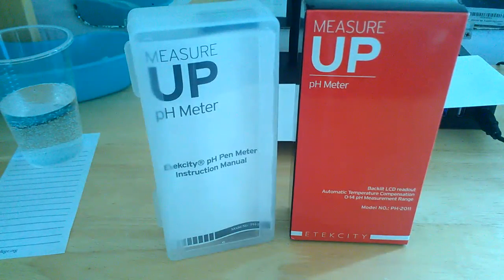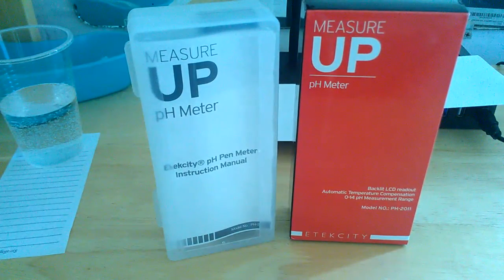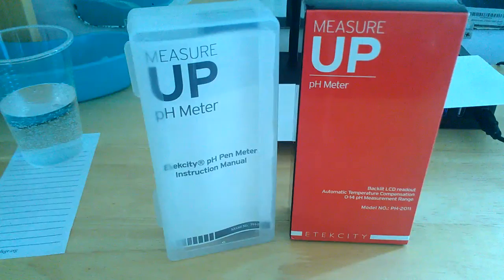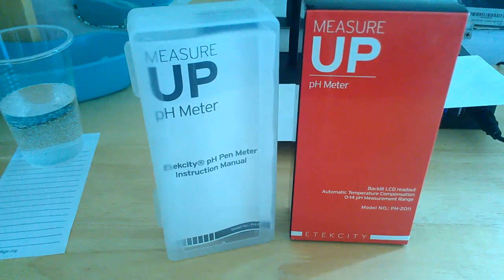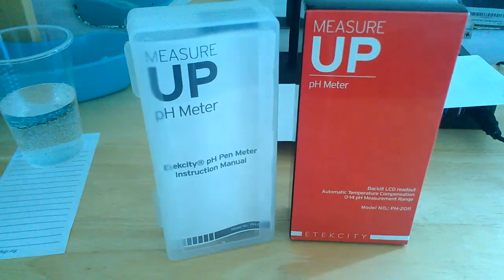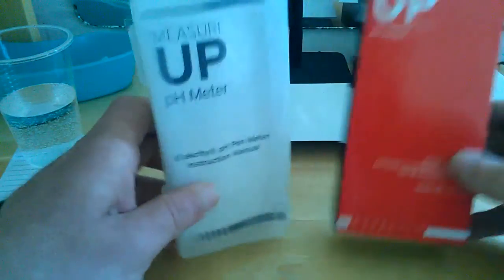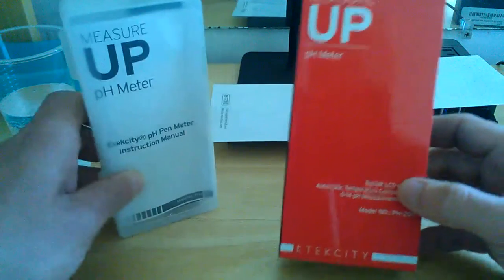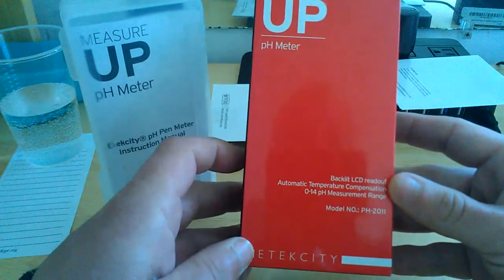Hi guys, Reviews4Us here, back with another review for you. This is for the E-Tech City measure up pH meter. It's the pen meter, it's digital. I'm just going to go over the box real quick here with you guys.